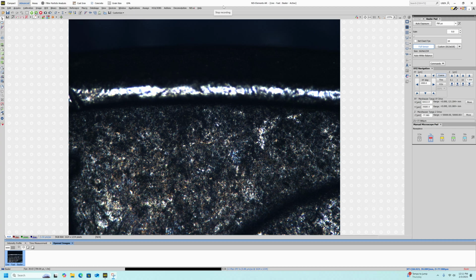This is a tutorial video on using image stitching with the motorized stage and focus drive on your microscope. This assumes that you have a motorized stage and focus drive on your microscope because you'll need to use the external joystick or the XYZ navigation pad in the NIS-Elements software for positioning the stage at its unique XYZ positions.